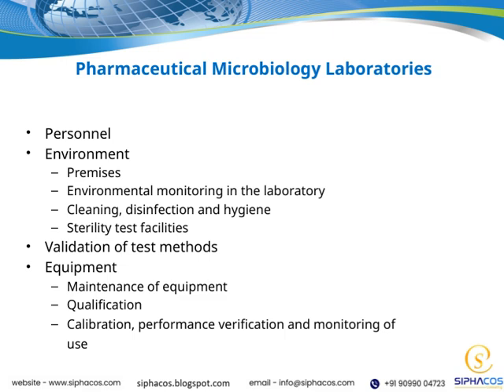Moving on to cleaning, disinfection, and hygiene. These practices are vital to prevent cross-contamination and microbial growth. Consistent cleaning protocols and hygiene practices safeguard the quality of our work and help us meet regulatory standards.